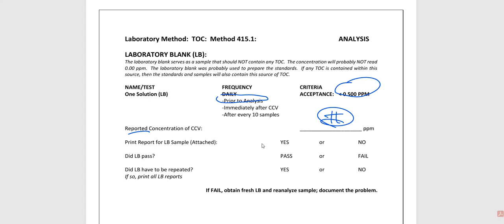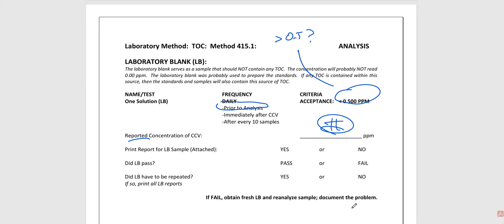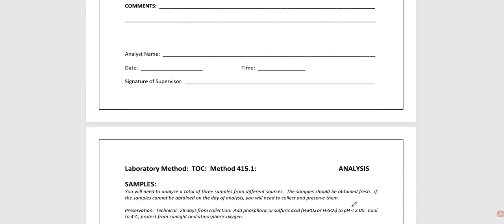There is a chance that contamination got inside of your container. It shouldn't have been there. They should be clean, unused containers. But, I mean, you know, shoulda, woulda, coulda. So if that is a problem or an issue, then that's one of the ways that we can fix it. To be honest with you, if this blank is greater than 0.5, then I'm going to be okay with that most of the time. I'm just going to say, let's deal with it. Let's go with the flow.